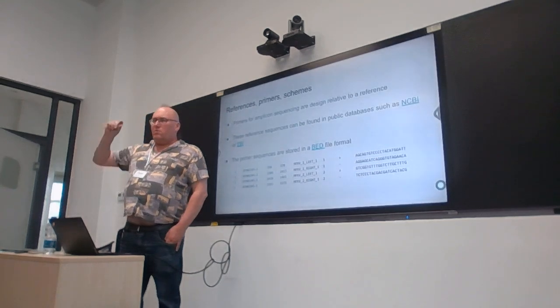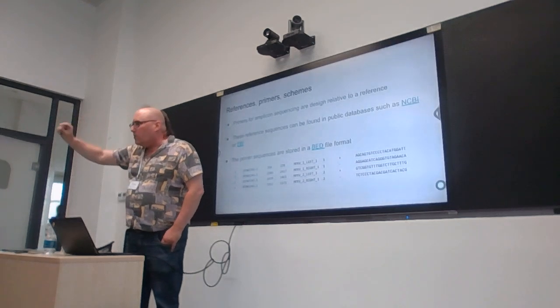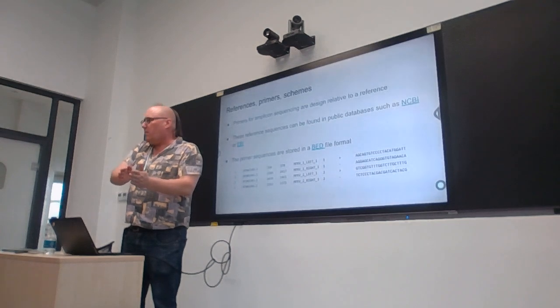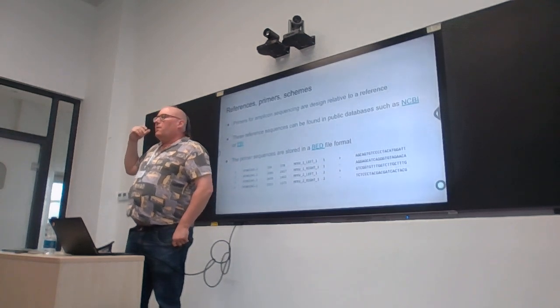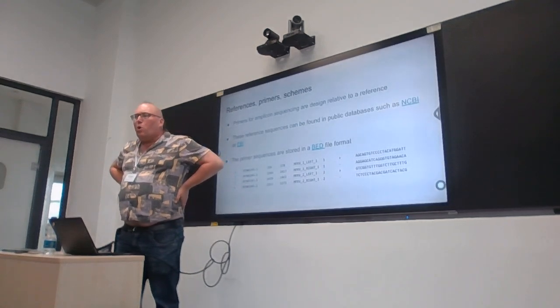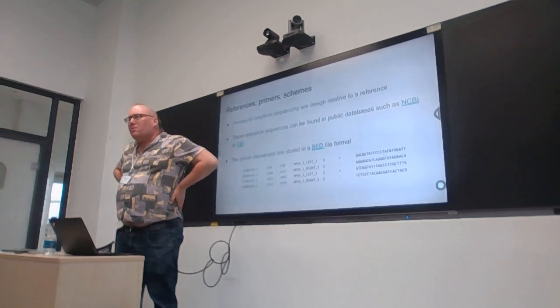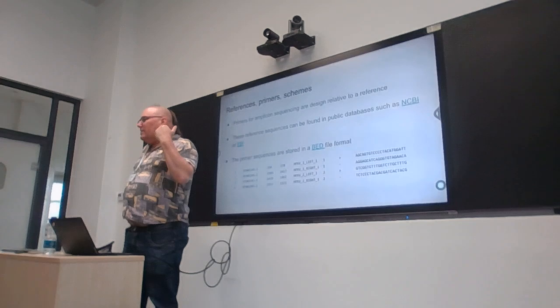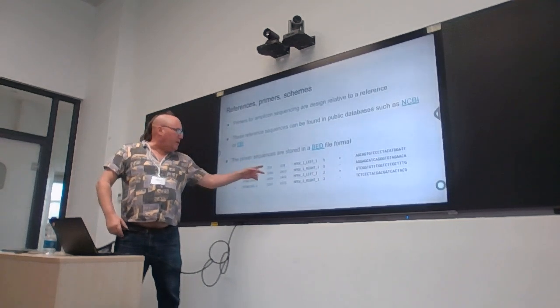So I'm now talking about the primers in terms of physical laboratory primers that you're going to use in your lab for the sequencing, okay? But if you are sequencing Mpox, what you are picking up is almost certainly going to be Mpox clade 1, right? So what the people on the analysis side have done is they've translated these positions, okay?